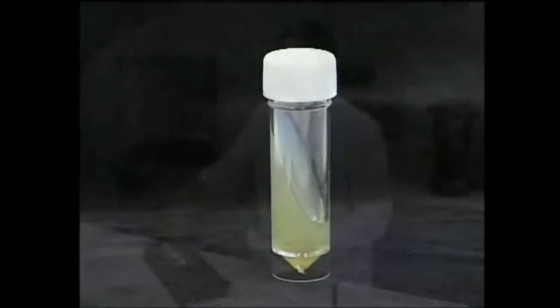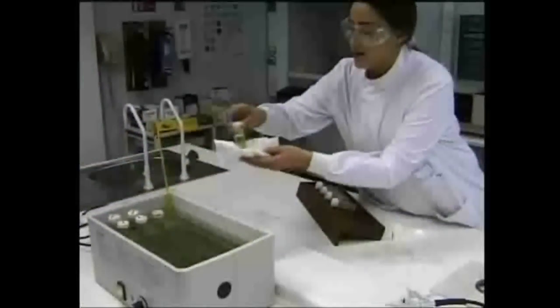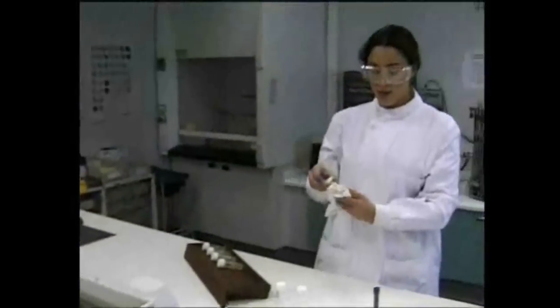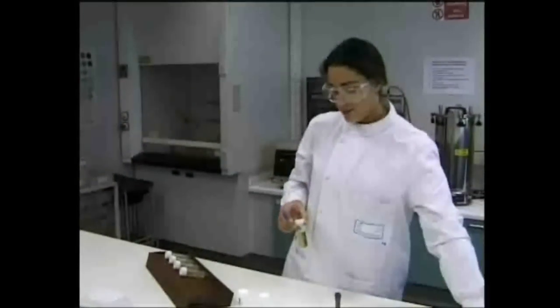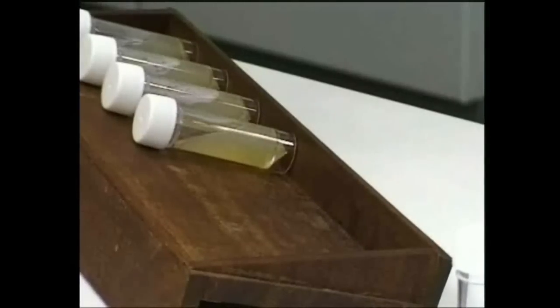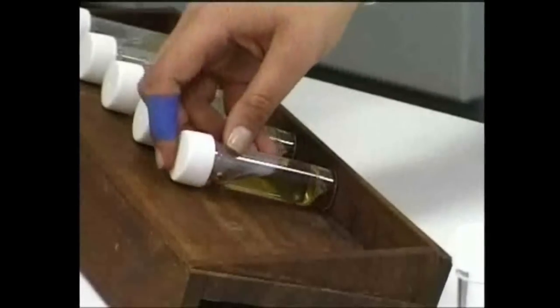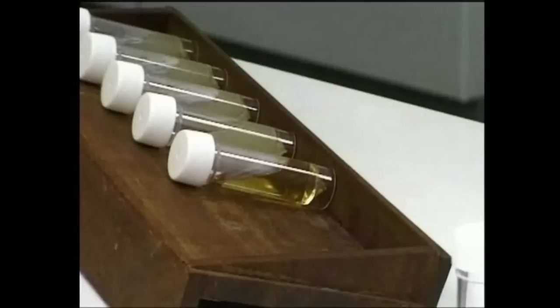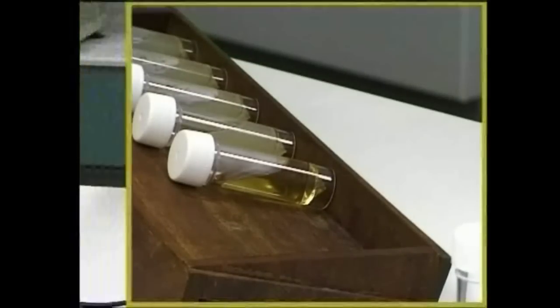The slope is made by allowing molten agar to set in an inclined bottle. The slope shouldn't reach more than two-thirds of the length of a bottle. Slopes give a large surface area to a small volume of medium, usually 10 cubic centimeters. In other words, they maximize the area available for bacterial growth.